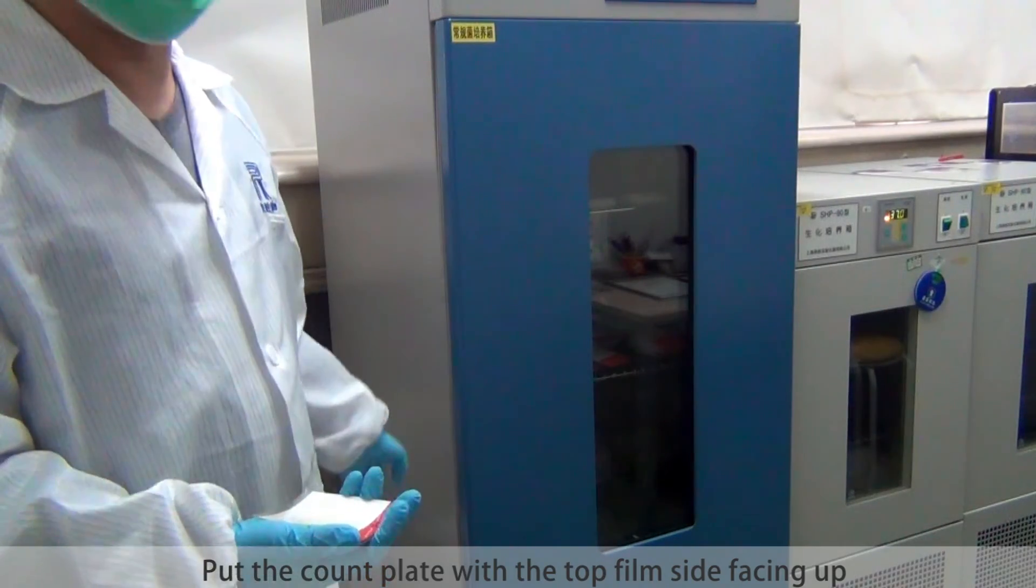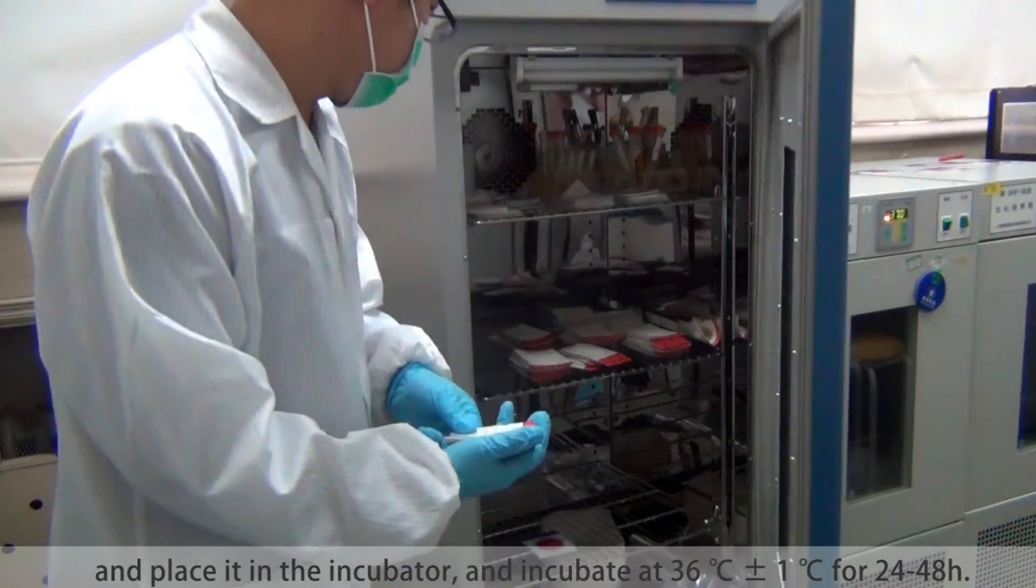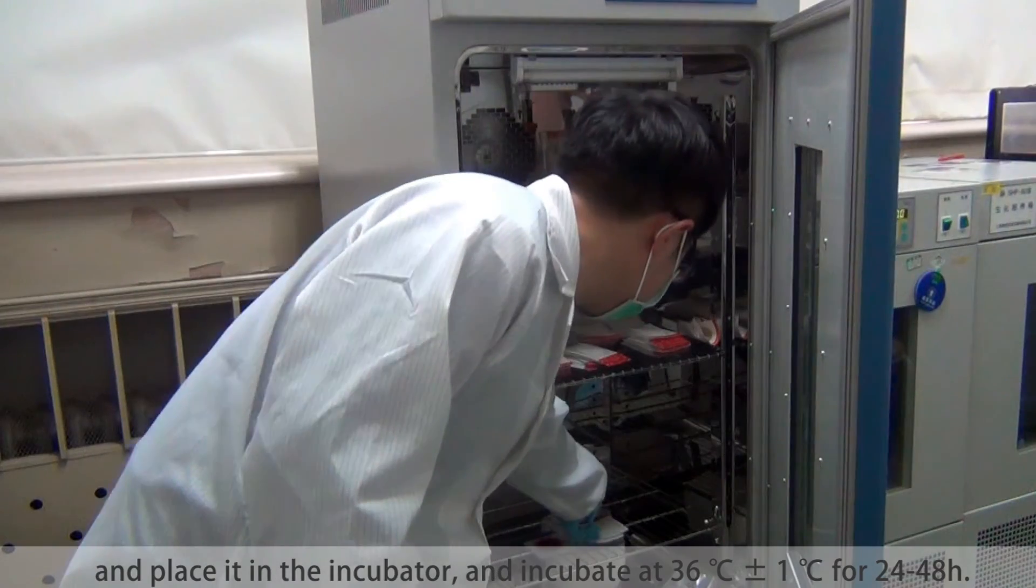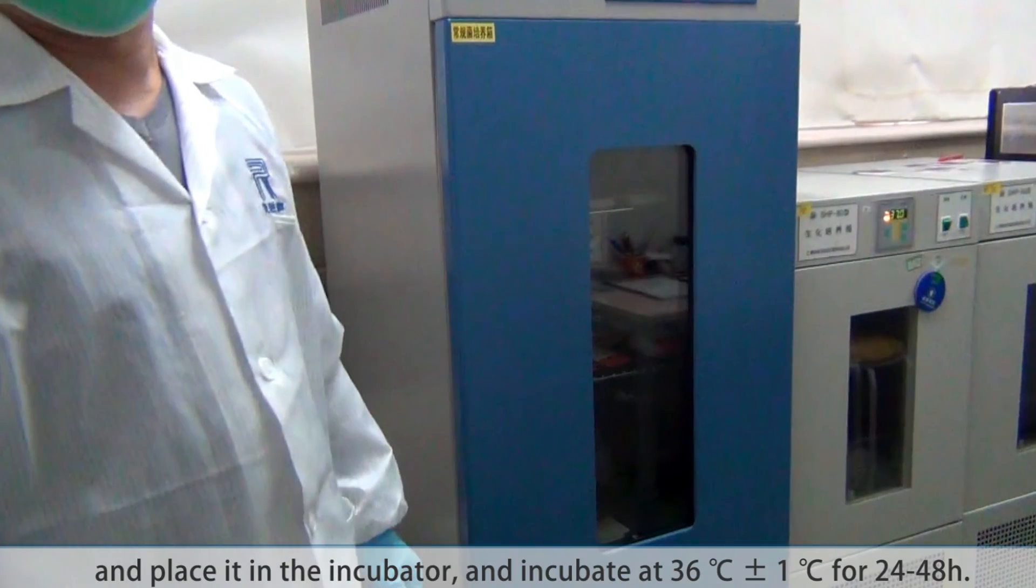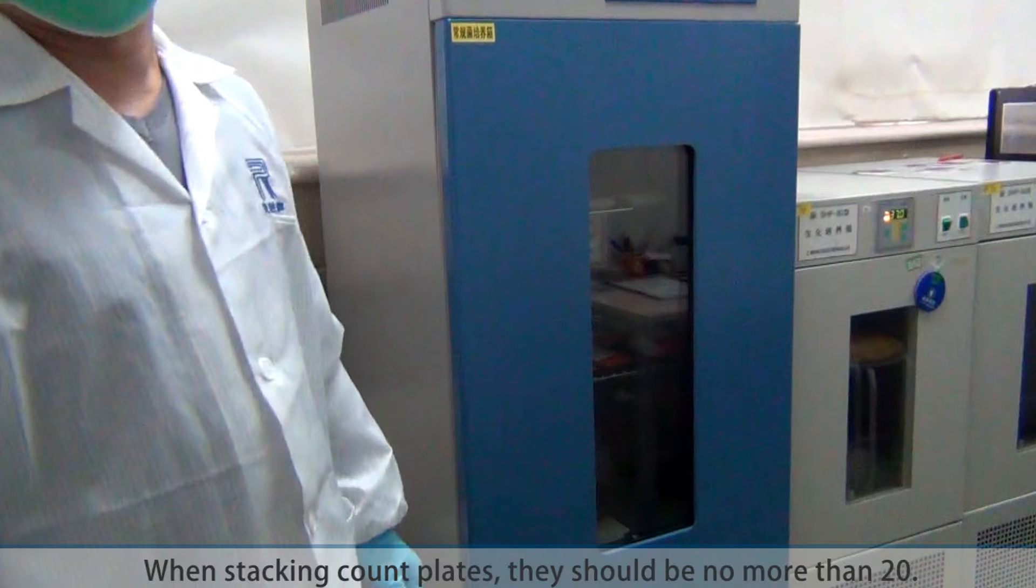Put the count plate with the top film side facing up and place it in the incubator at 36 degrees centigrade, 1 degree above or below for 24 to 48 hours. When stacking count plates, there should be no more than 20.